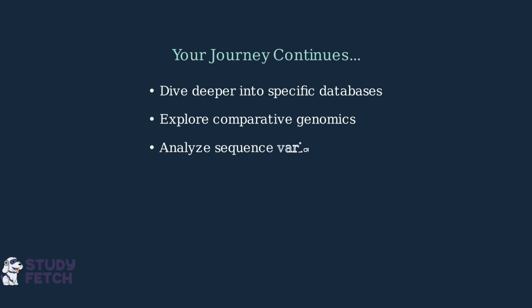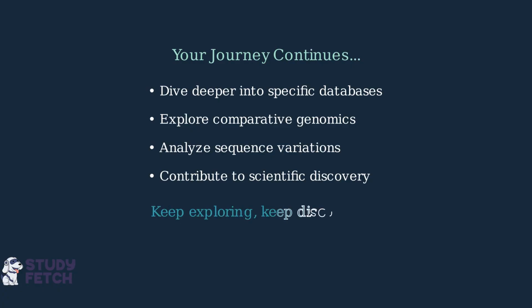Continue your journey by diving deeper into specific databases, exploring comparative genomics, analyzing sequence variations, and contributing to scientific discovery. The world of genomics is at your fingertips. Keep exploring, keep discovering, and unlock the secrets hidden within genetic sequences.